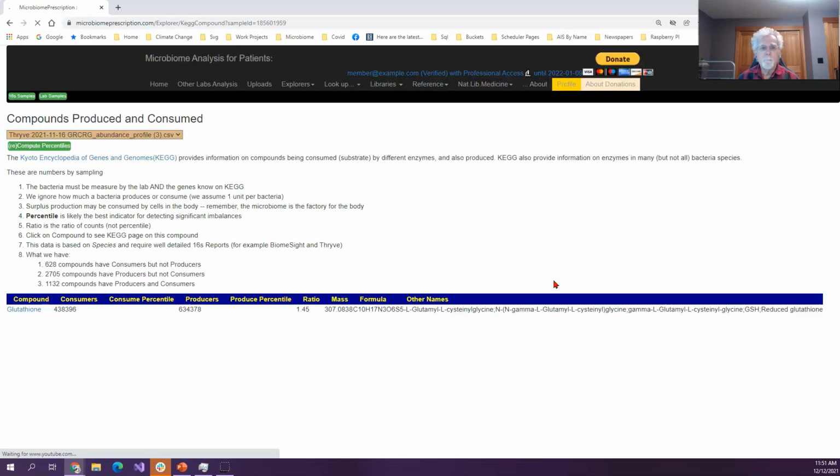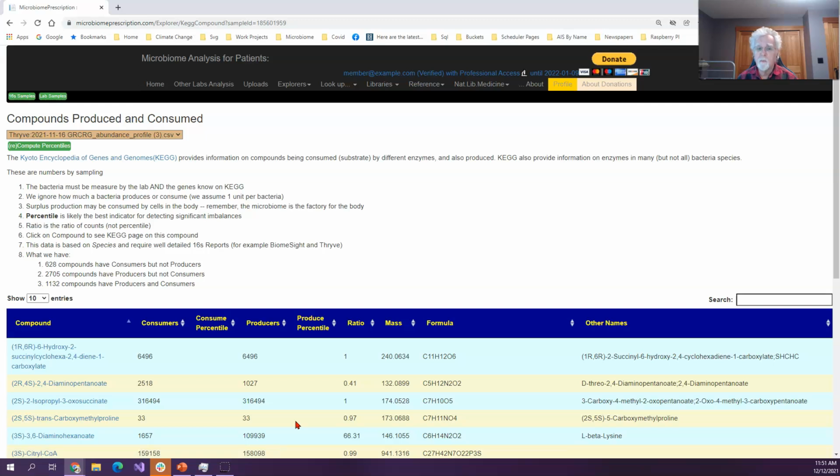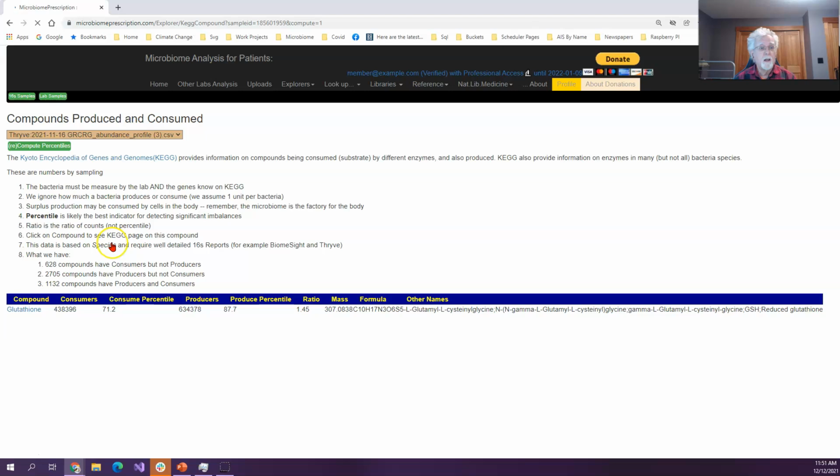We go in there and we get the numbers, and you notice the percentiles are missing here, and that is intentional because it takes a while to compute them. And so on upload, it is just burning too many cycles, and few people are actually probably going to be using it. So I've deferred it, and if you want to get them calculated, which you should if going to this page, just click here. And then we have a bit of a long wait.